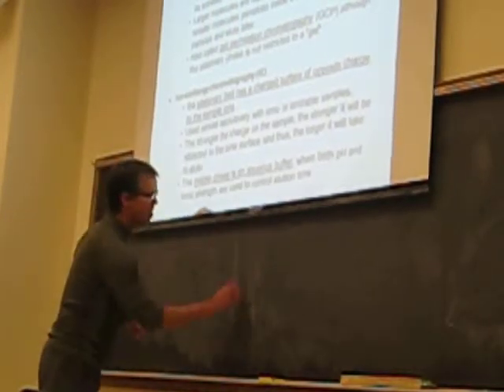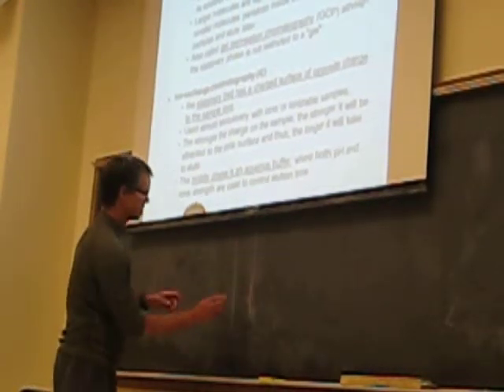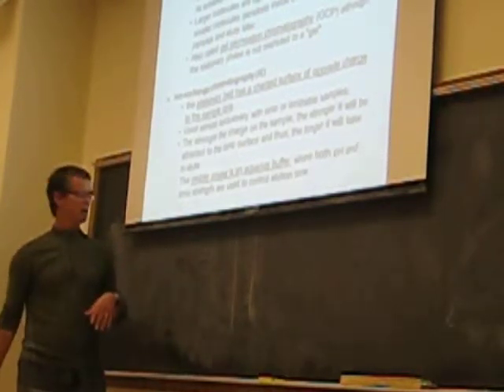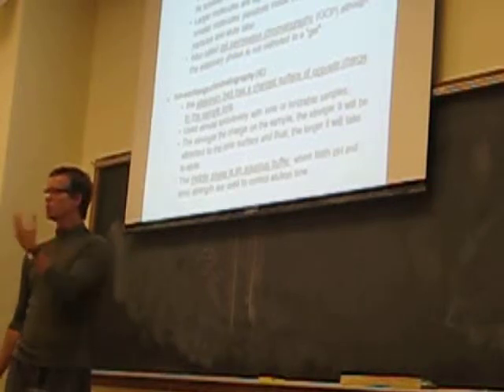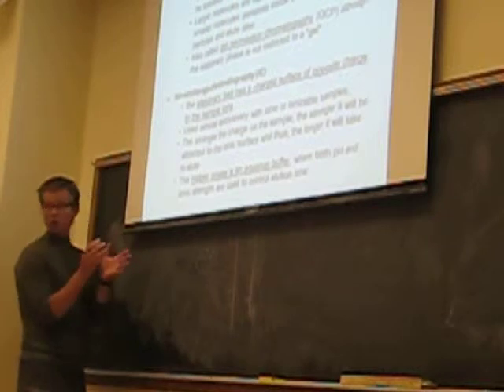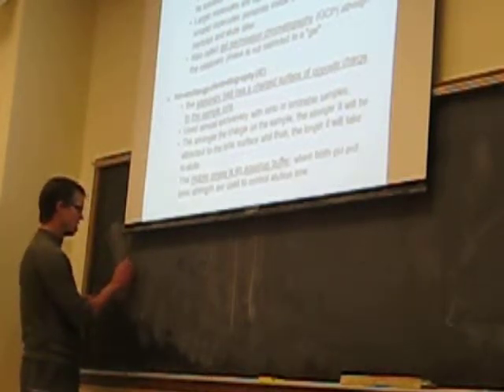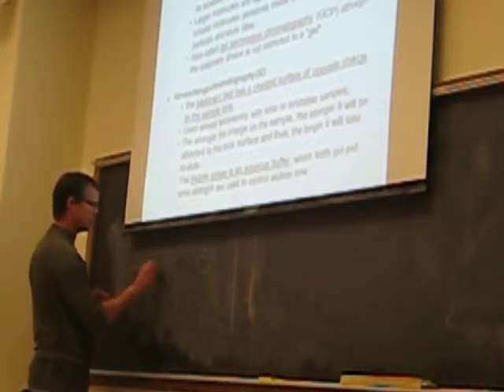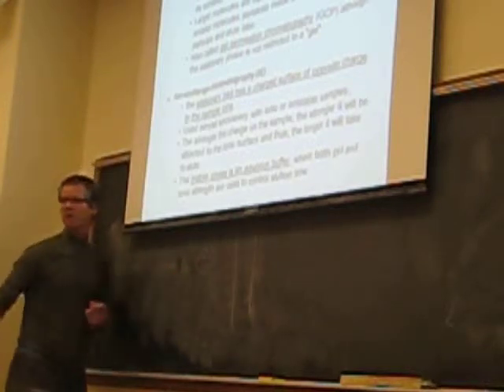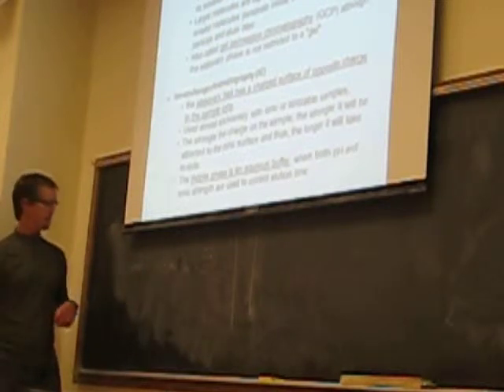And so you have a column that's packed full of these things, these wiffle balls, with a pore size that's selective for a particular molecular weight size, based on what your separation is. And so, let's say you're trying to separate things that are, these are for larger things. These aren't for dissolved small compounds. These are for things usually in the 2,000, maybe up to 100,000 Daltons, right? Molecular weight. So these are biological molecules typically that you're trying to separate, not small anions.